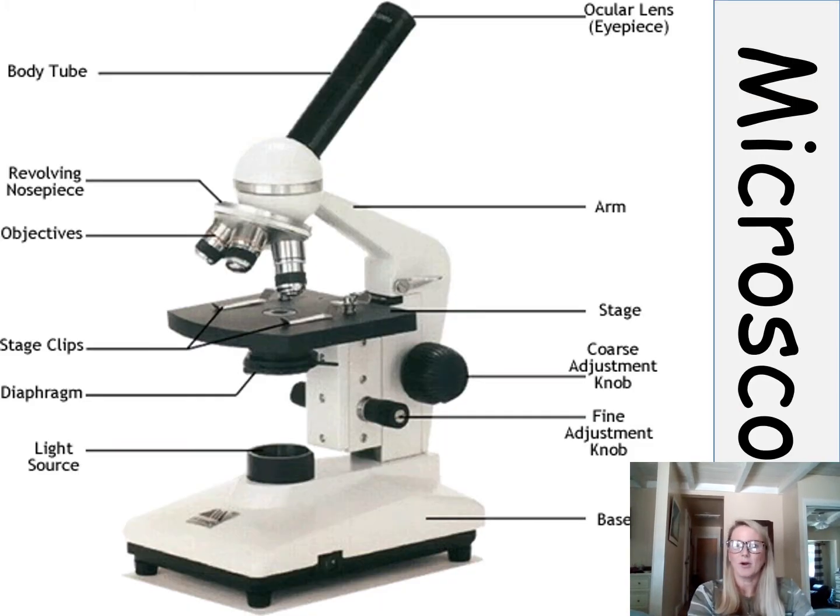Okay, the second part of the lab is really just looking at the microscope and getting to know its basic parts. The microscope is a really great tool that biologists use. If we were in the lab right now, we would be using it to look at Euglena. Unfortunately, thanks to COVID, we are here doing this. So the microscope is a tool to obviously magnify things.